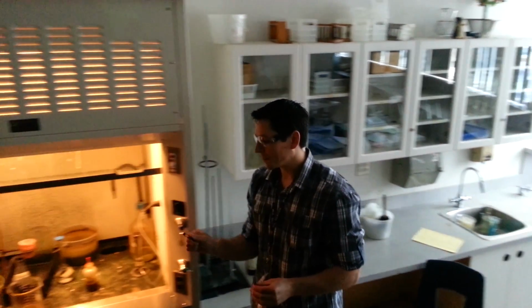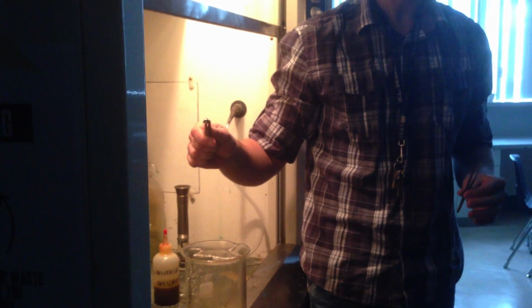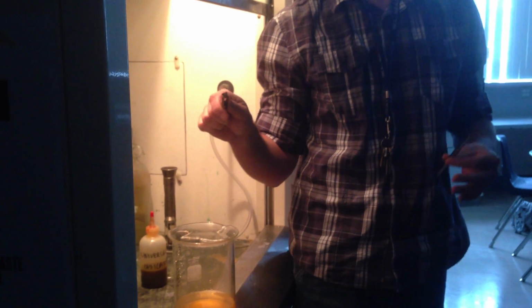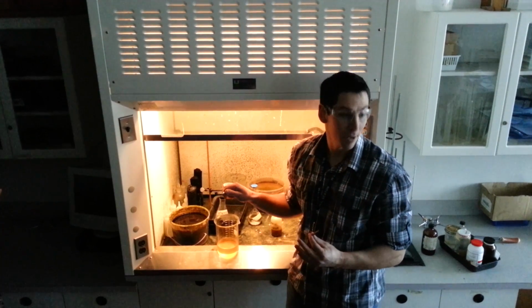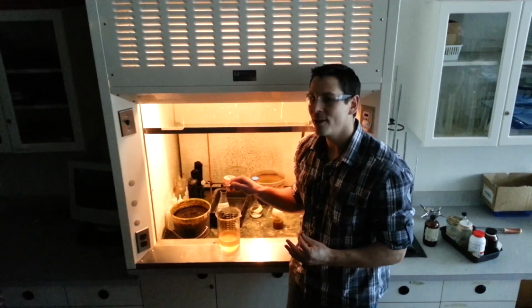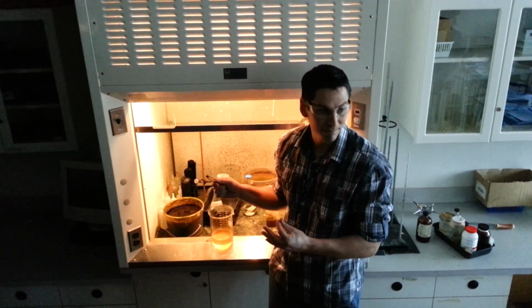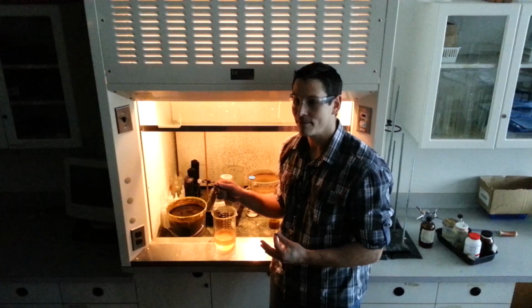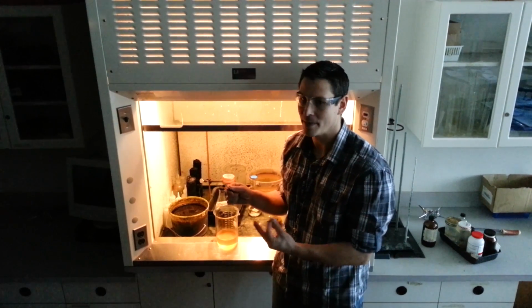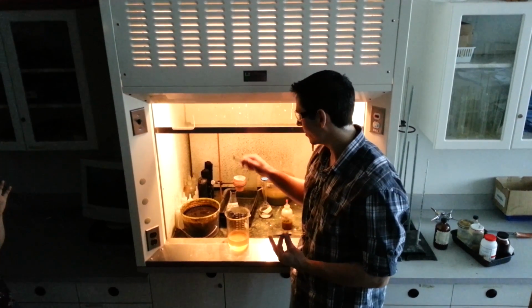Okay, so all of these alkali metals, they look all oily. The reason is that they're stored in oil. They're not intrinsically oily. And the reason they're stored in oil is that all air has what dissolved in it? Hydrogen. Water. Okay. And the water in the air will react with these things, and so they're covered in oil because oil and water don't mix. They repel each other, right? And so that keeps this relatively safe to handle. If it were to touch my hands, the oil would be a barrier between the sweat and the lithium, and I'd be okay. So what we're going to do is drop it in the water.